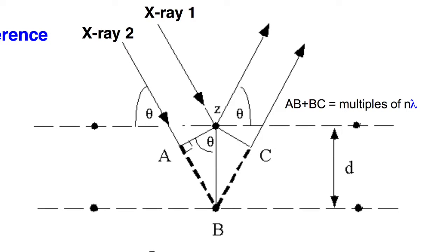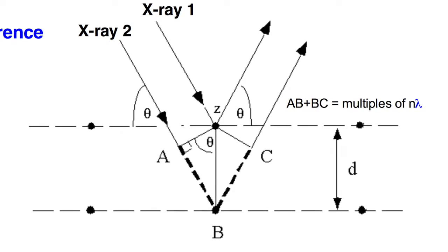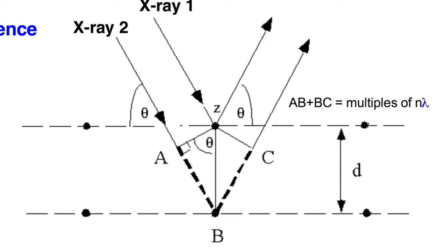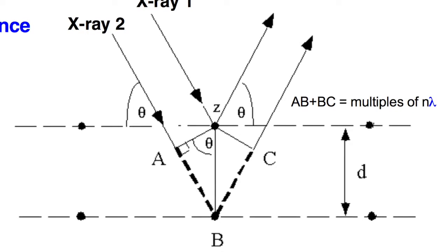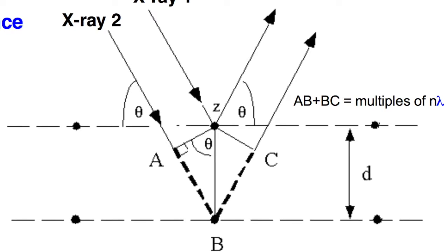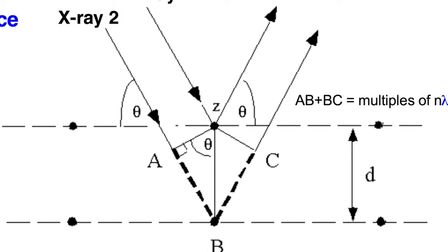In a crystal, many layers of the molecule's unit cell are stacked on top of and around the nucleus of the crystal. Through the usage of X-ray diffraction, the orientation of the layers and the distance between them, also known as d-spacing, can be calculated. The greater the space in between layers of a crystal, the larger the diffraction pattern.